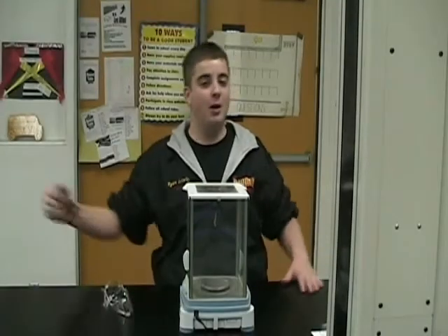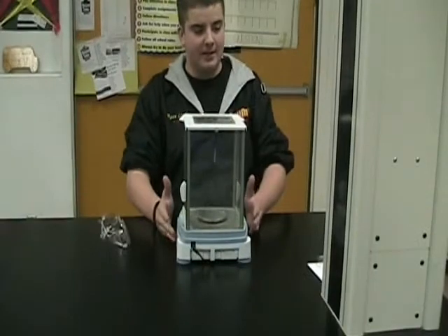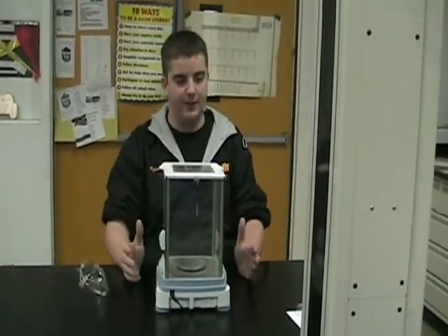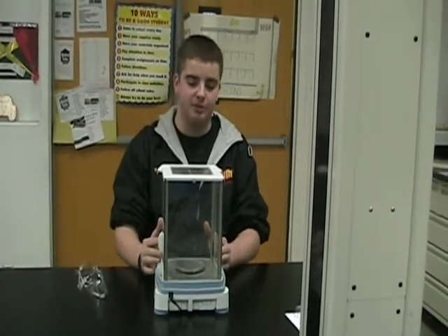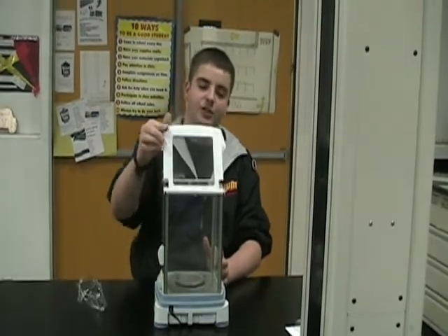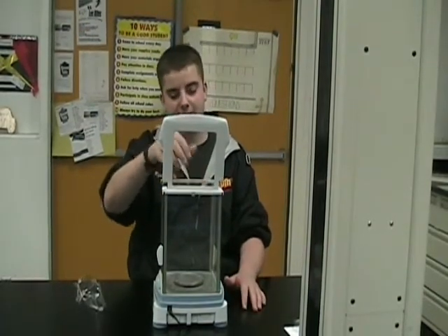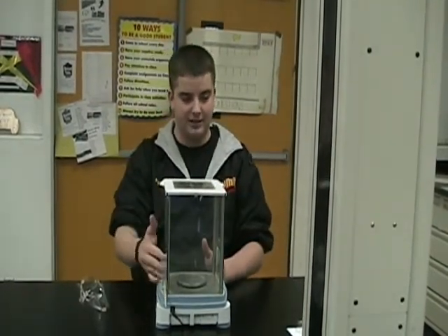Now Ryan, how about we see if you know everything about the analytical scale? Okay, here we have the analytical balance. As you can see, this balance is very tall and has three different opening contraptions — one on the top and two on the side. You should only use the two on the side, never the one on top, because scooping substances in from the top will make a mess. So you should always use the side doors.